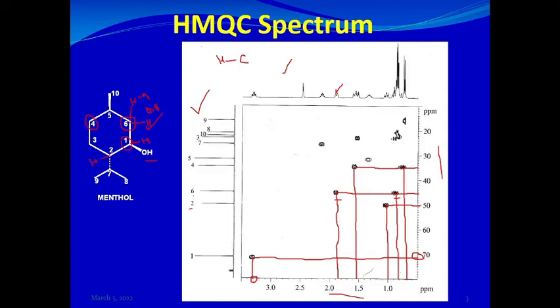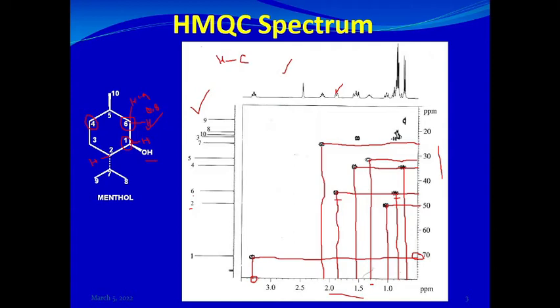Carbon number five is a CH. This carbon resonates at about 32 ppm and its attached proton resonates at about 1.3 ppm. Carbon number seven is also a CH; it resonates at about 25–26 ppm, and its proton resonates at about 2.1 ppm. You can use a ruler to draw straight lines horizontally and vertically to read these correlations accurately.